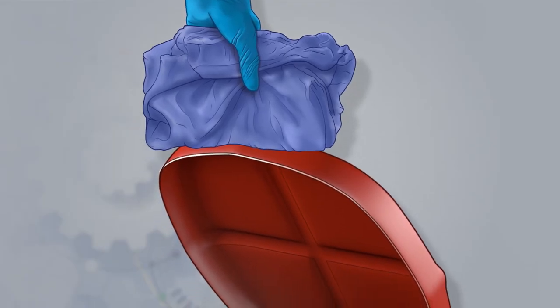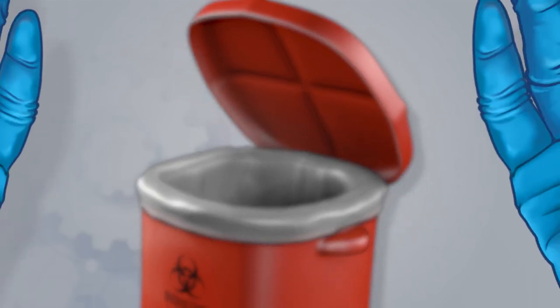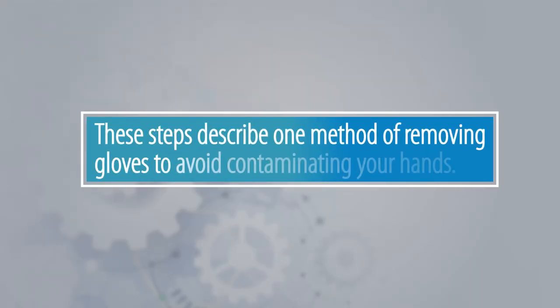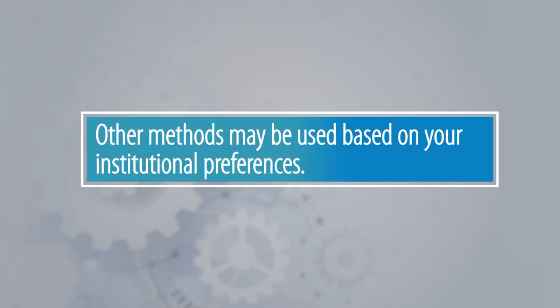Dispose of the bundle into the biohazard waste container. Next, slowly and gently remove your gloves. These steps describe one method of removing gloves to avoid contaminating your hands. Other methods may be used based on your institutional preferences.